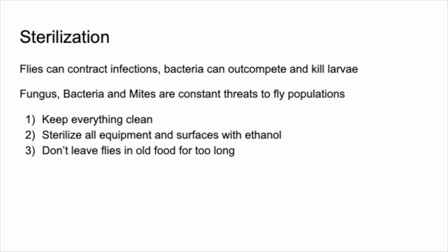And being very careful is pretty easy, luckily. You want to make sure that you're keeping everything clean, so don't let mess pile up. If you spill food or any edible or rottable substance, you want to make sure that you clean it up promptly. No matter what it is, if you're using equipment, you want to make sure that you're sterilizing it afterwards with ethanol.